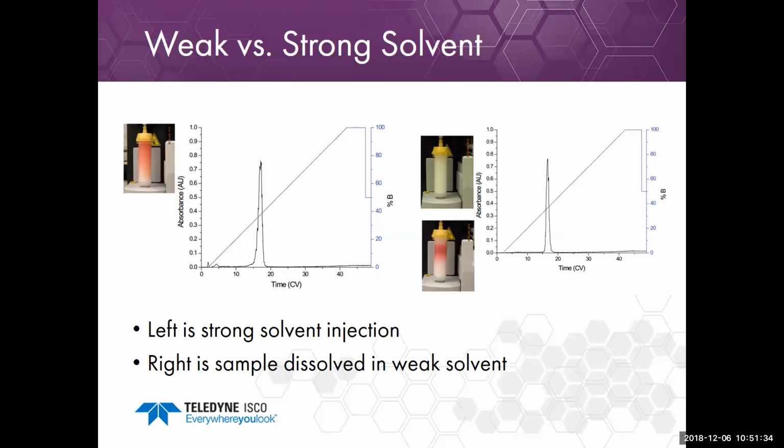Actually, I had the same thing happen to me. I was running the compound on the analytical system, and then when I took it over to the prep system, it showed up as two separate peaks. What I found the difference was my analytical system, I had the water from one source. I used bottled water, HPLC grade water, and for my prep system, I was using 18.2 megohm water from my water purifier. What happened is that I had a change in pH, and that's caused my peaks to show up as two separate peaks.